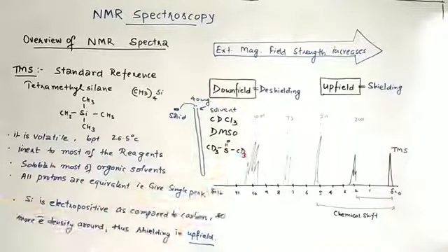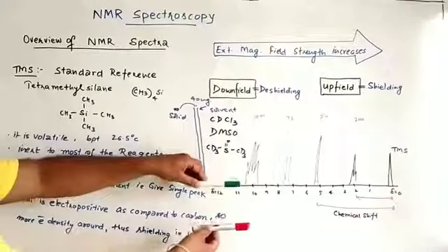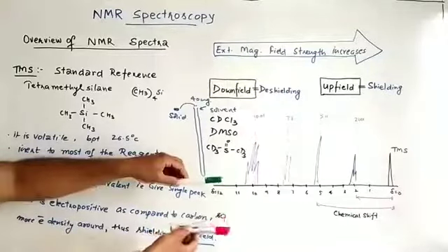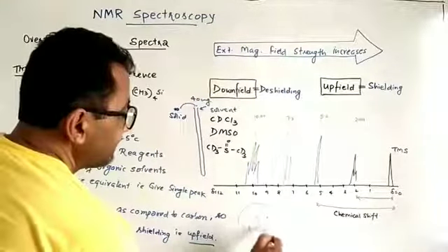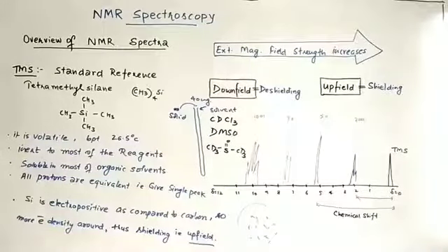For peak 10.01, the external magnetic field is very low, so the distance is small. At this distance between alpha and beta, some proton in the organic compound may become resonant with the electromagnetic radiation and flipping takes place. There are various types of protons in an organic compound. Some protons may flip at lower field strength, some at higher field strength, depending upon their environment.